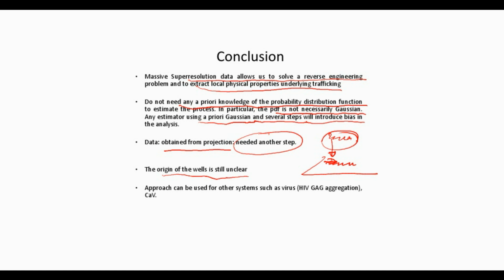So I'll conclude this lecture by saying that what I've discussed with you today is an example, a method that we have developed to extract single particle trajectory features. It is based on computing two moments, and I hope that I have convinced you that this is the right way to analyze your experiments.